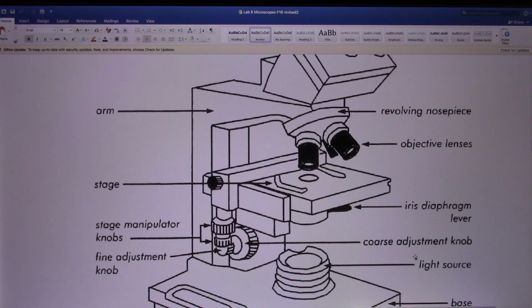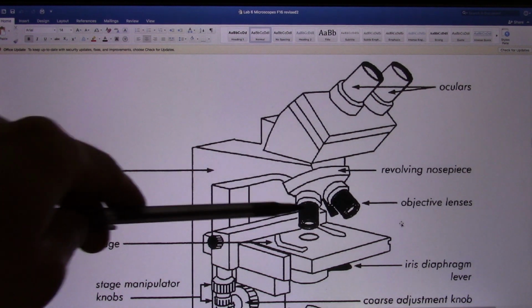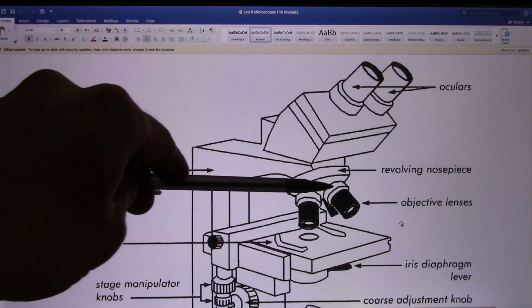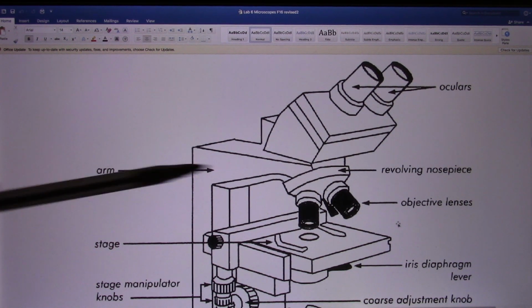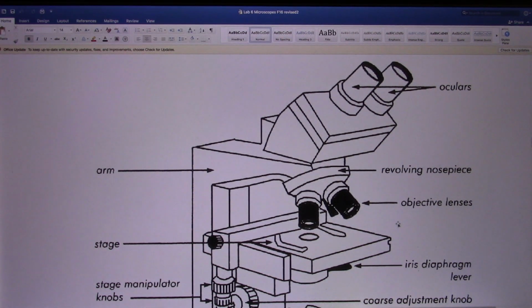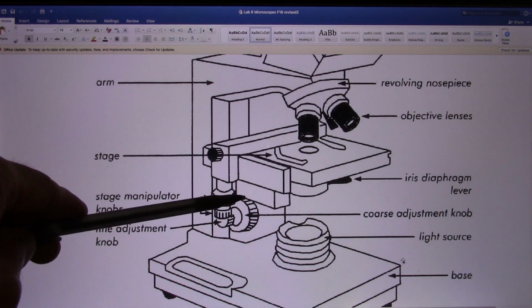So you can think of the microscope as a big magnifier. It just amplifies the signal, but you have more than one lens. Basically, you have these two, right? Ocular and objective. So instead of amplifying the signal once, it amplifies the signal twice. So you take this one, multiply by this one. It will be the total magnification. So it's a very powerful magnifier. And this is called the coarse adjustment knob.